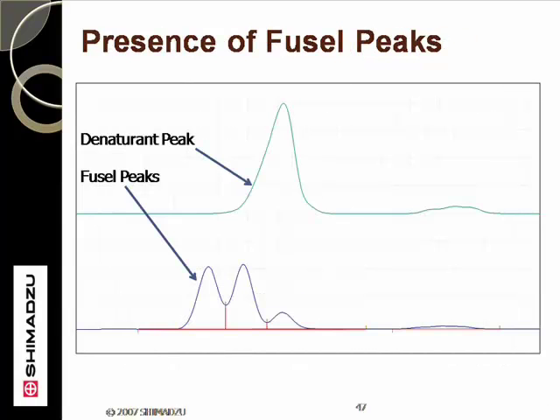This slide shows a comparison of a denatured ethanol sample on the bottom with just denaturant on the top chromatogram. It is clear to see that the denatured ethanol sample in the same area of the analysis has more peaks present than the denaturant. In this case, the ethanol distillate is providing fusel content which is being counted as denaturant.